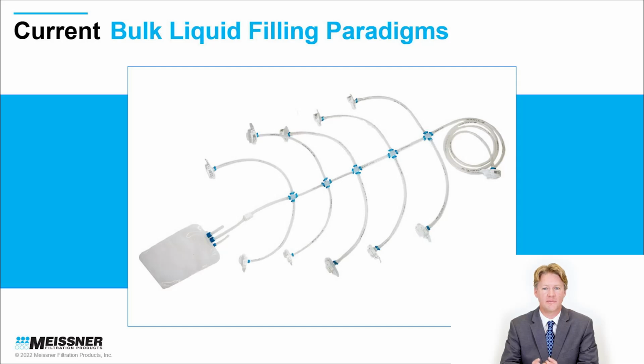Manifold assemblies are the most commonly deployed bulk liquid filling strategy, but they have several disadvantages, such as difficulty manipulating larger configurations and the potential for leaks and contamination at each of the connection points in the assembly. Manifolds are also time-consuming and very labor-intensive to lay out, make all the connections, fill each bag individually on a scale, and then seal each and every fill line.